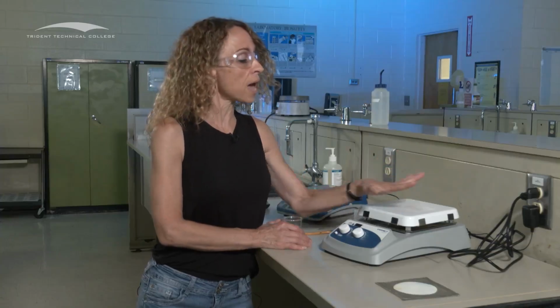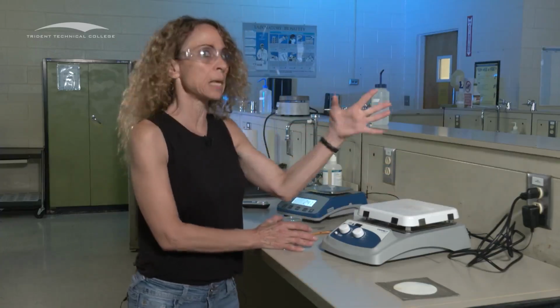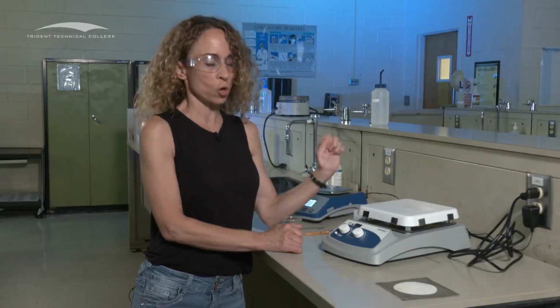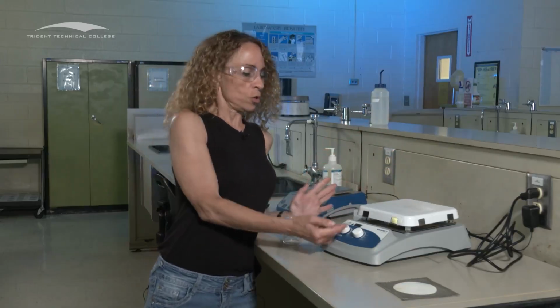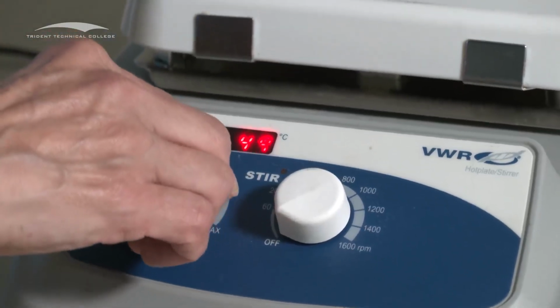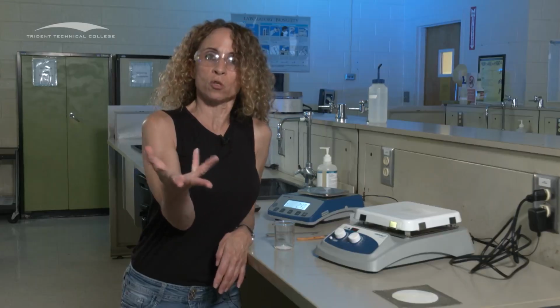You do not want to have anything near the surface, including any pens or anything. They will melt. You don't want to touch this with your hand, okay? Now, when you go to turn it on, you see there's a heat and a stir knob. We're not stirring anything today. We're heating.